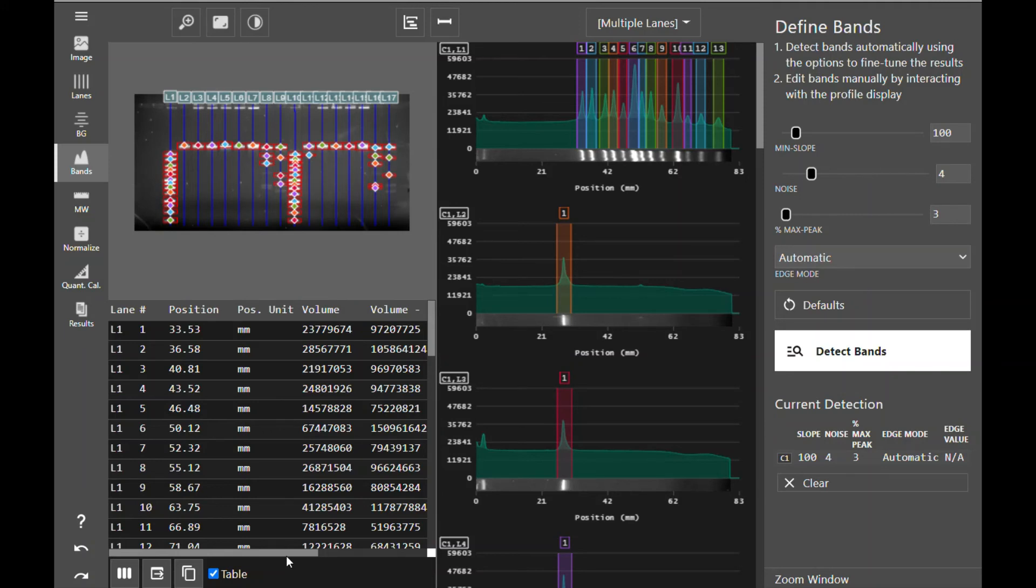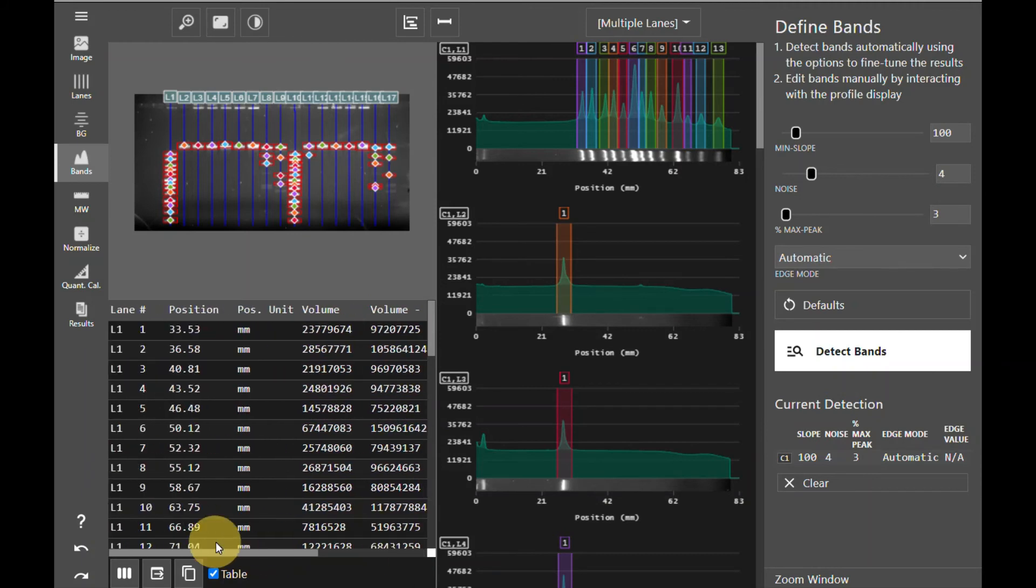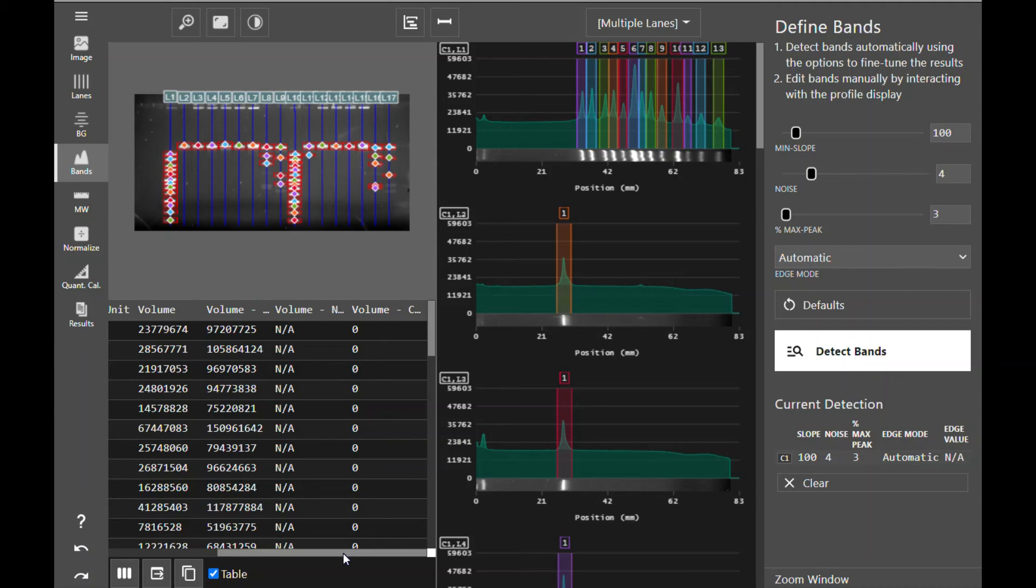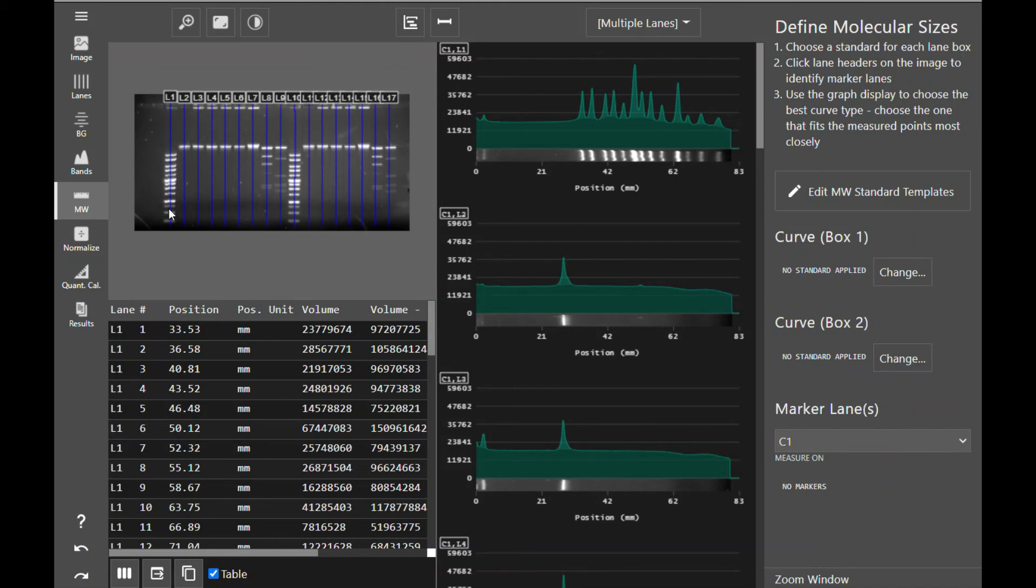Once you have detected your bands, you'll see the data table now displays all of the columns and information that you selected. For many users, this can be the end of your simple analysis: creating lanes, subtracting background, defining bands, and determining their volume. For those who want to get a little bit more out of their image data, we move on to molecular weight. The molecular weight tool in Azure Spot Pro allows you to apply your molecular weight standards and markers to your image in order to determine the weights and sizes of your bands based on the interpolated data from the curve created by your molecular weight standards.